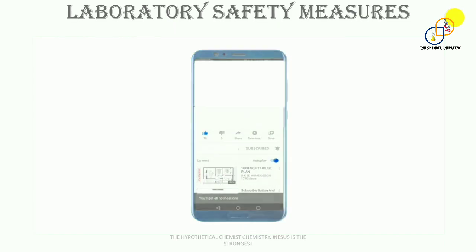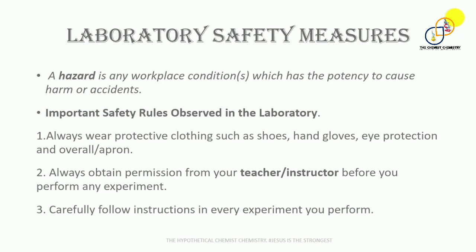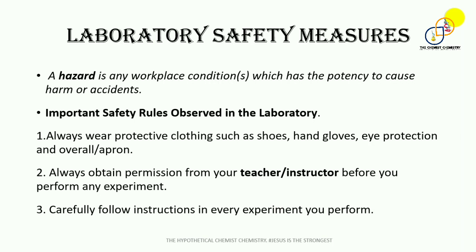Alright, the main lesson: laboratory safety measures. You can also term it as laboratory safety rules or precautions. The chemist is exposed to a lot of dangers anytime he or she finds him or herself at a laboratory.